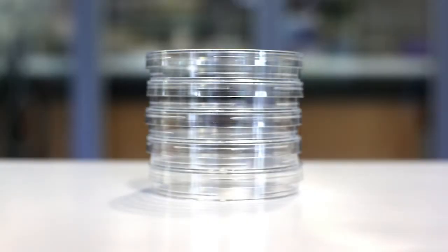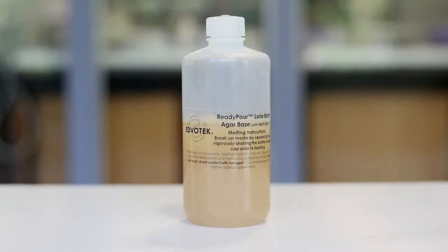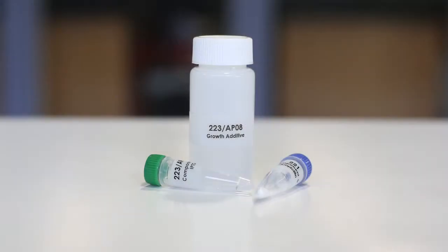Edvotec instructional videos: pouring agar plates. For this experiment you will need sterile petri plates, sterile pipettes, a pipette pump, Edvotec's ready pour agar, and media supplements.